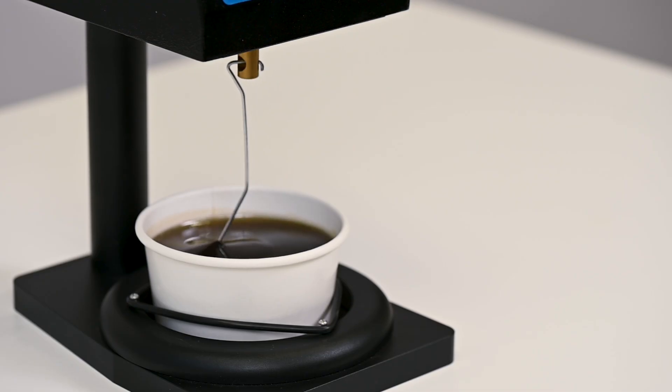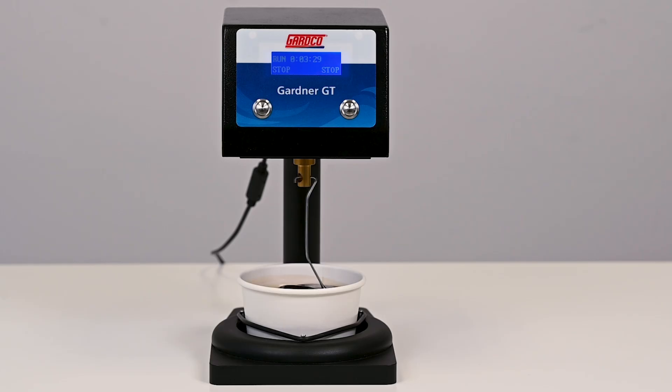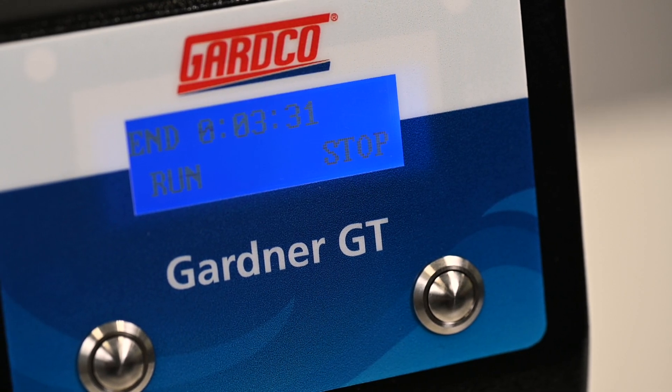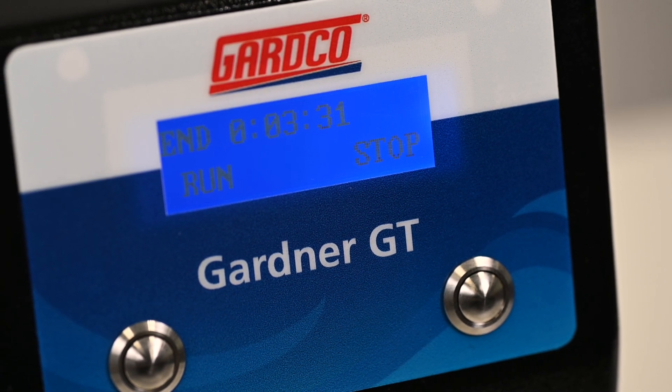When the sample has reached the torque threshold indicating the gel has hardened, the wire stirrer and timer will stop. The time shown on the instrument is the gel time of the sample. Note the gel time for your records.